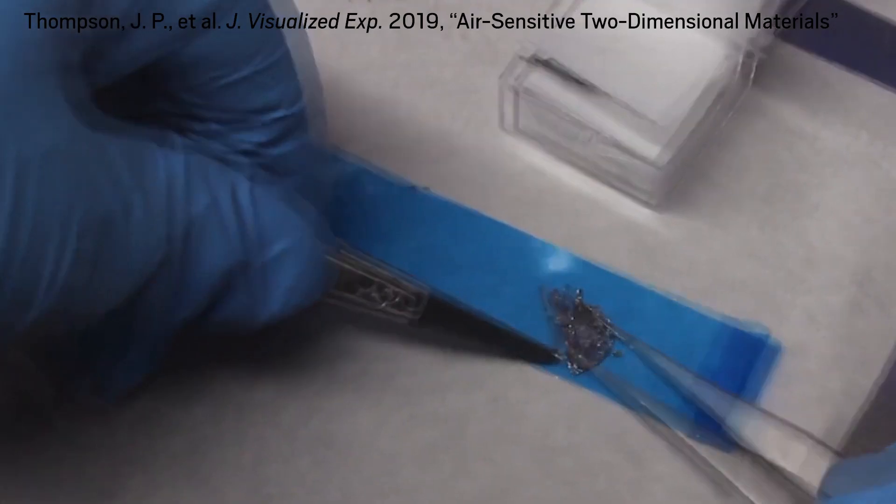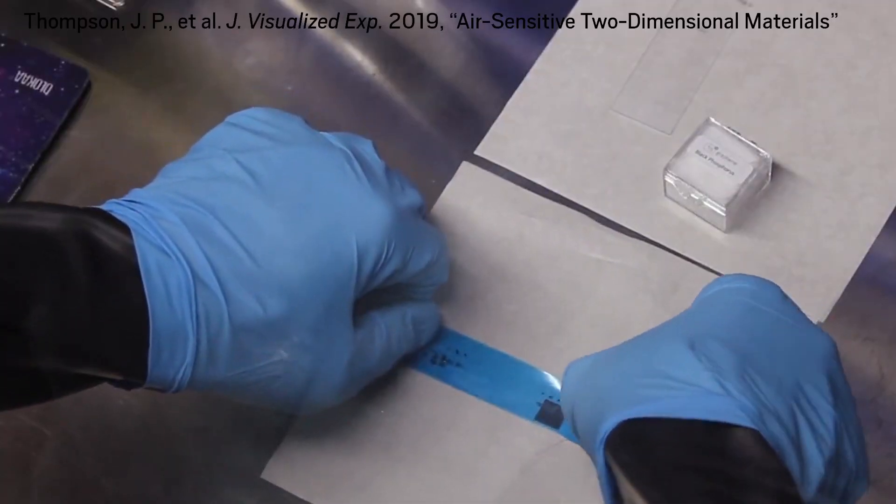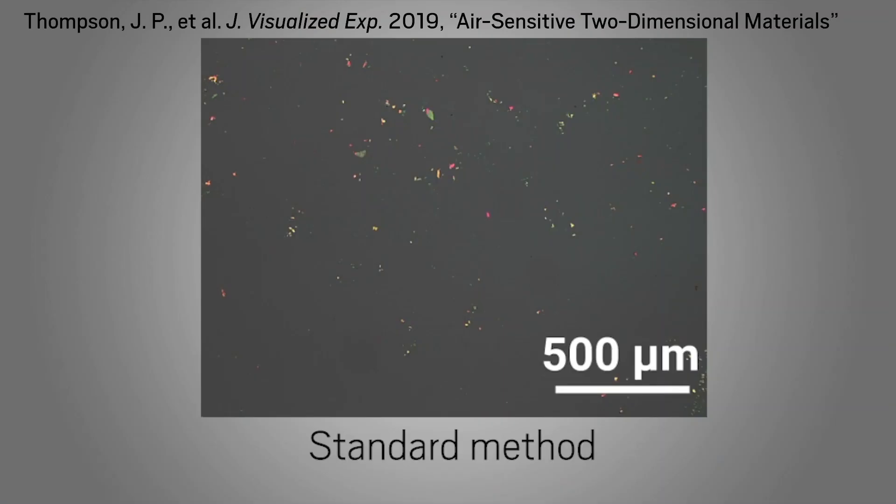To make flakes of some of the newer 2D materials, researchers commonly peel them away from a larger block of material with adhesive tape. But this method often results in small or less-than-pristine flakes.